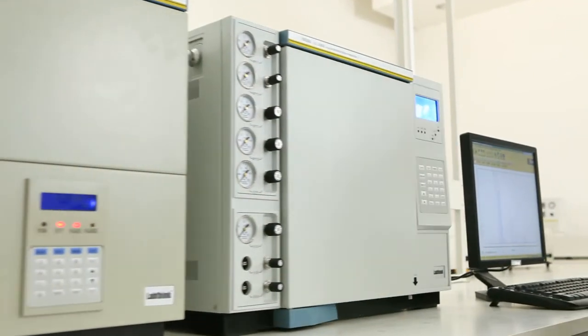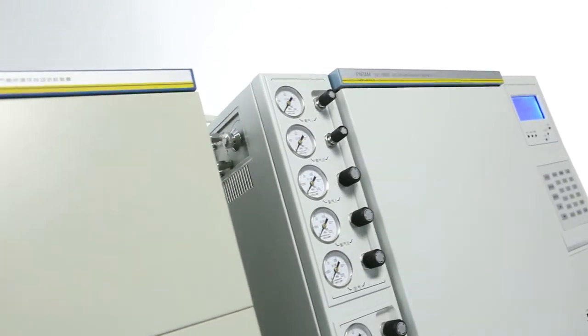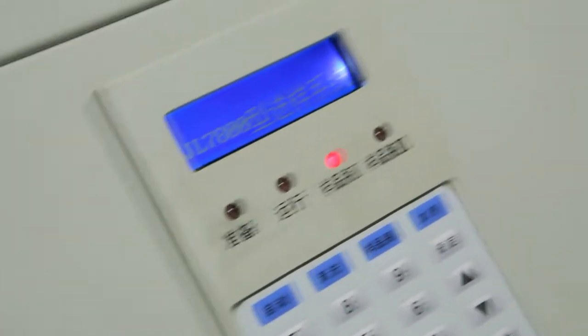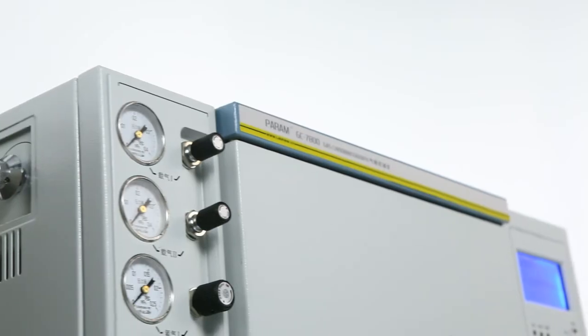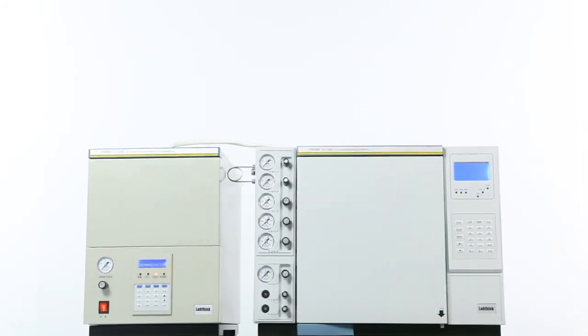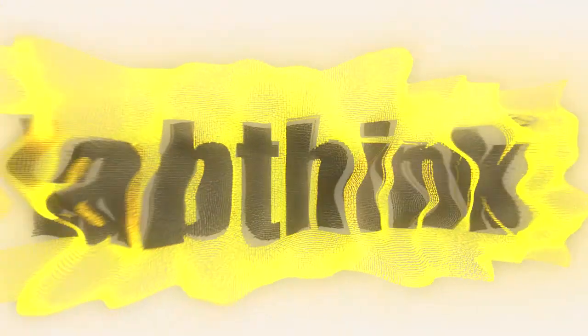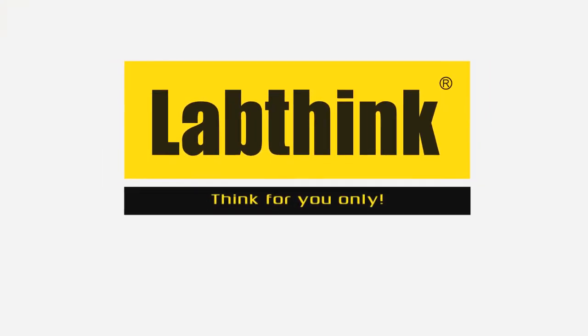packaging manufacturers and food and pharmaceutical industries to conduct high-precision residue and purity analysis of organic solvents. LabThink. Think for you only.